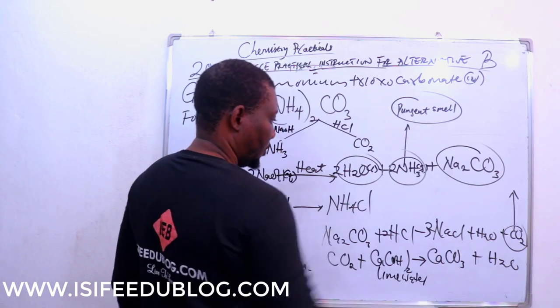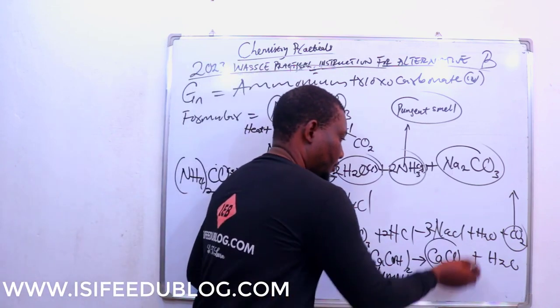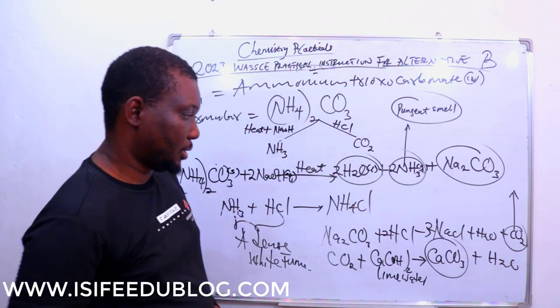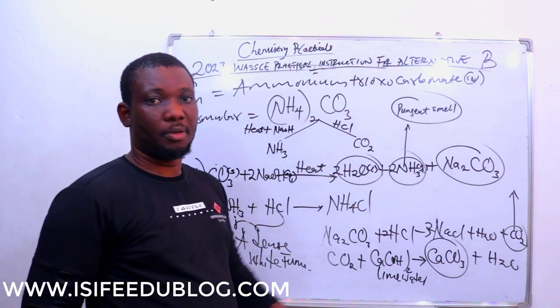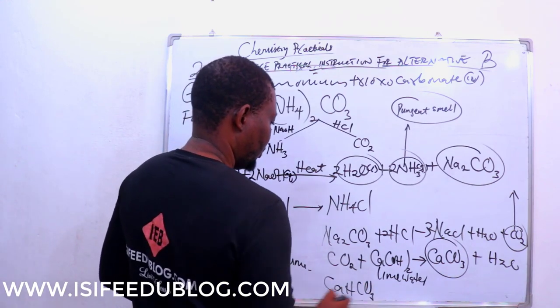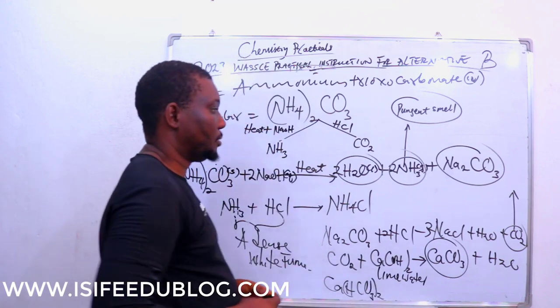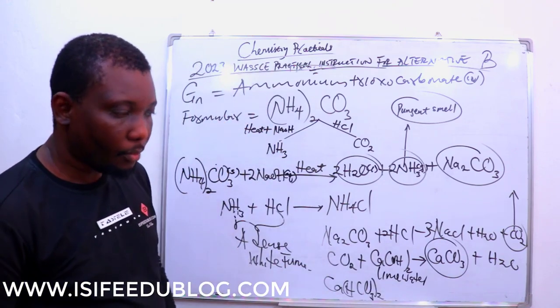Lime water, which unfortunately goes milky due to the formation of this. But the milkiness will start to disappear on excess bubbling of the gas due to the formation of this, which is soluble in water. Okay, so in this case, the test.